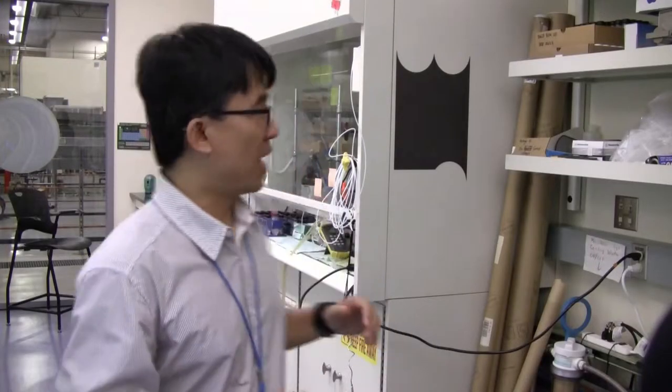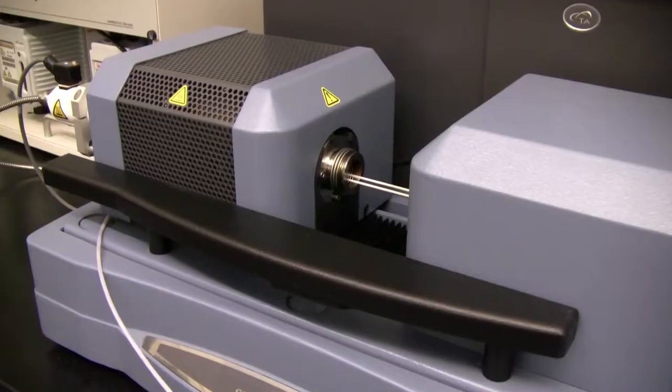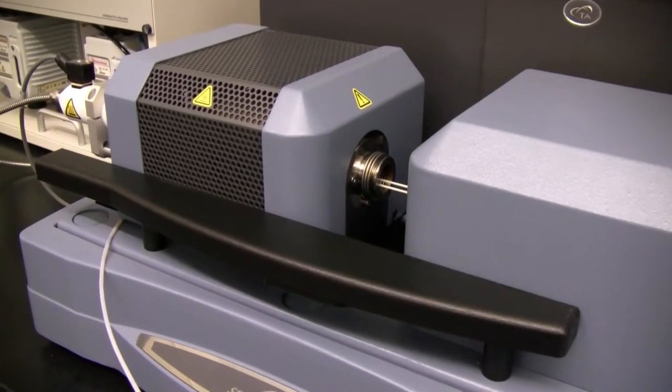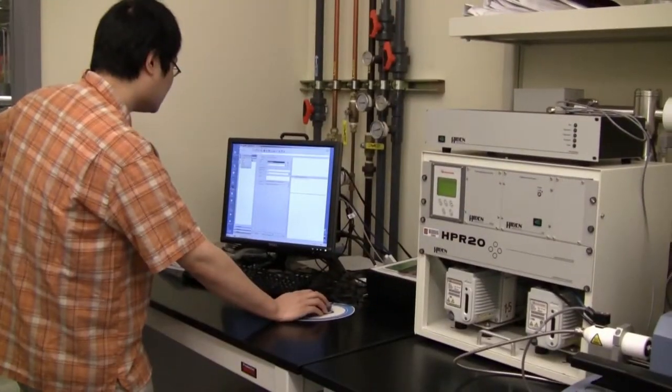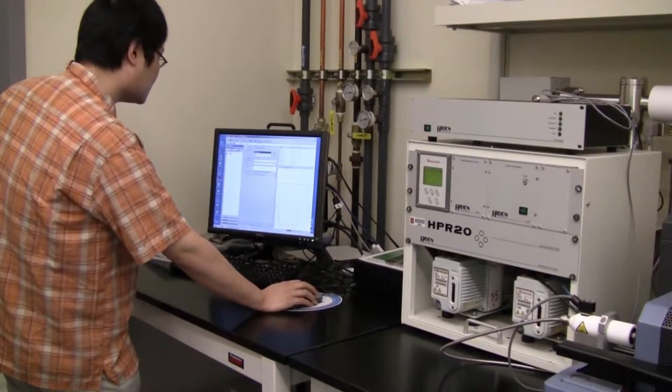We have another tool, the TGA coupled with a mass spec. Essentially you can look at a thin film conversion process or nanomaterial conversion process. You can look at what molecules are coming out of your film.